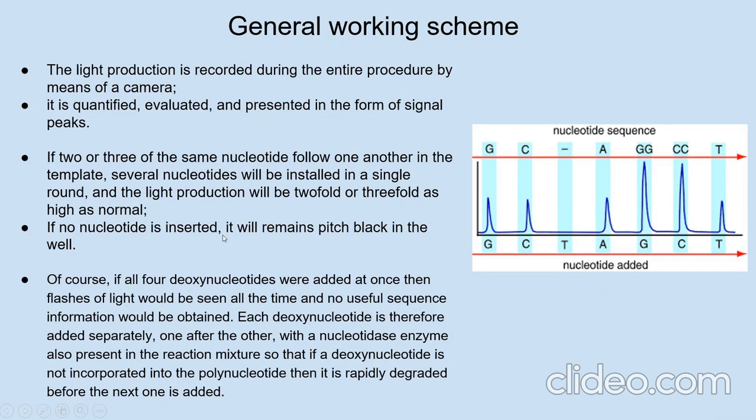Now, if no nucleotide is inserted, it will remain pitch black in the well, and there is no signal peak on the graph, as we can see in the case here. See over here that we have used no nucleotide, and here no signal peak is seen.